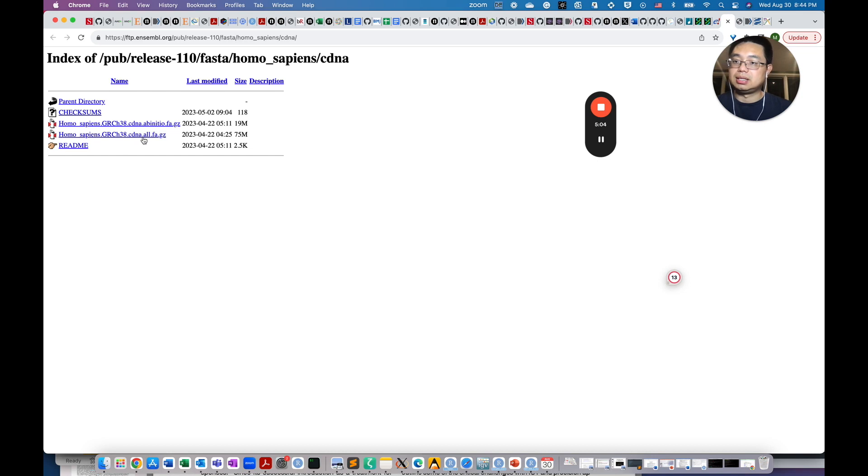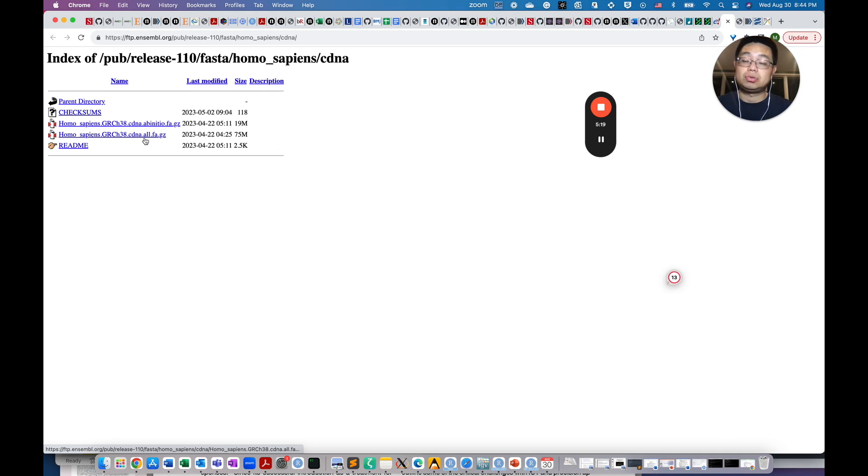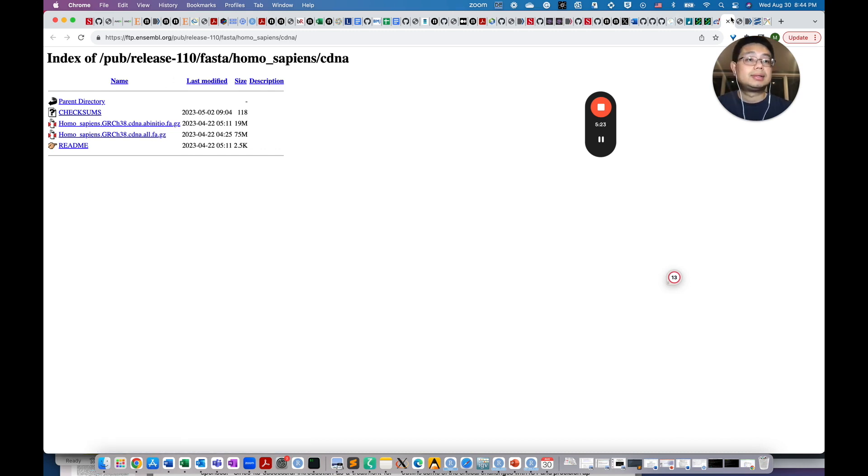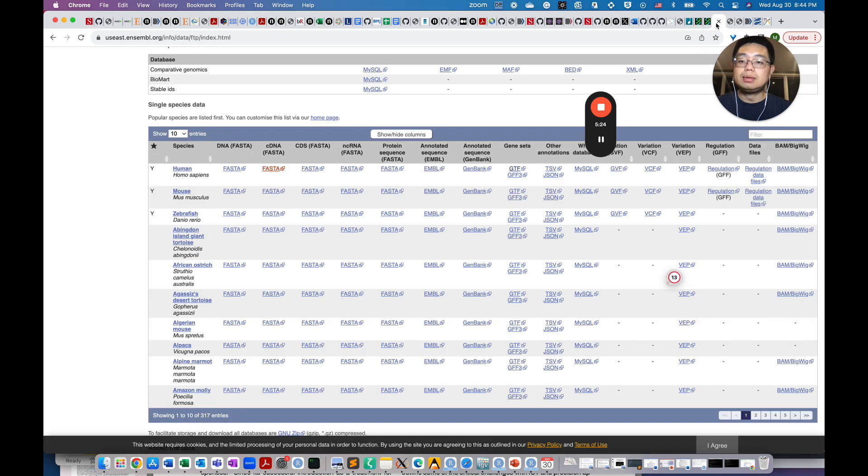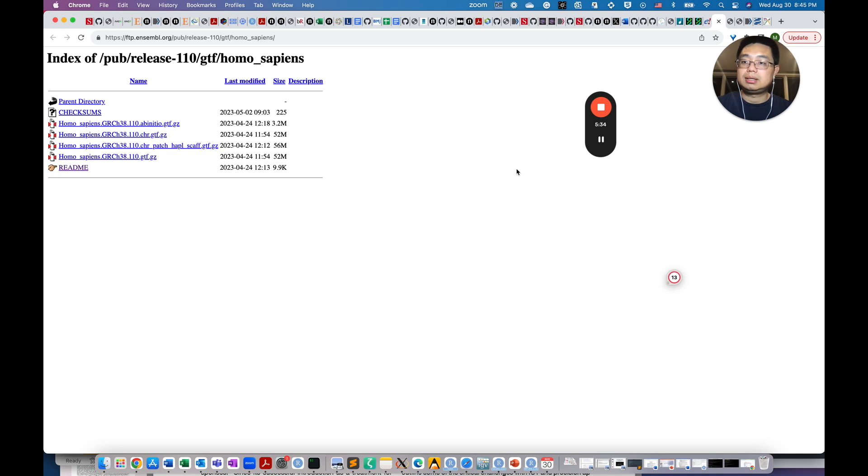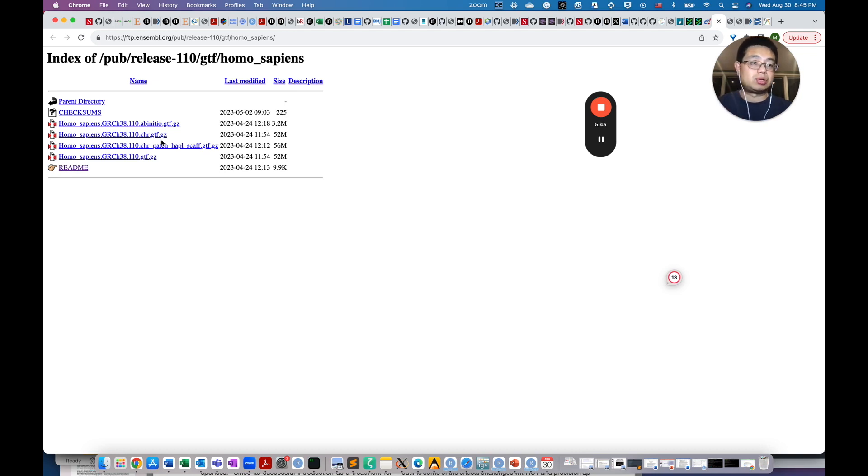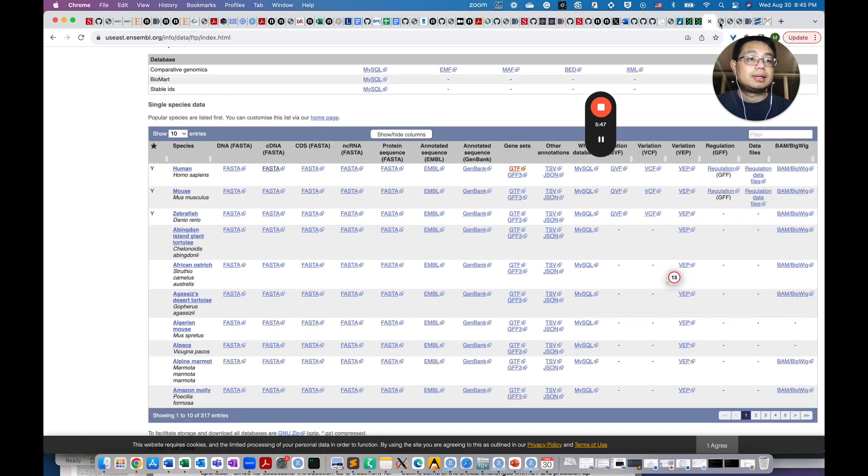You'll see the cDNA.all.fa.gz file. This is the file that you need to make an index, for example, for RNA sequencing quantification tools such as Salmon and Kallisto. And you see here, you also have the GTF files here. So if you click here, so you see those are the GTF files, essentially the gene annotation file telling you where are the genes and where are the transcripts or the isoforms.